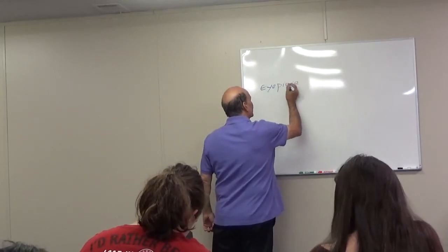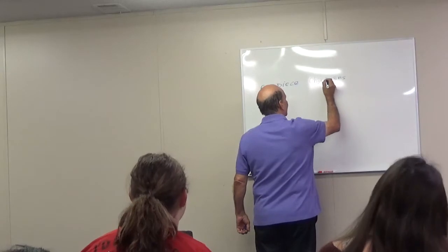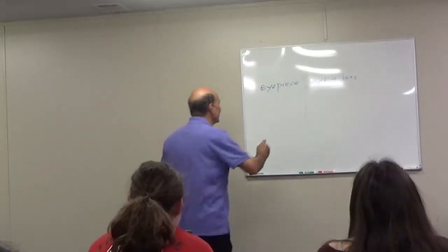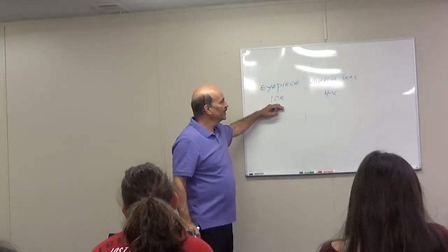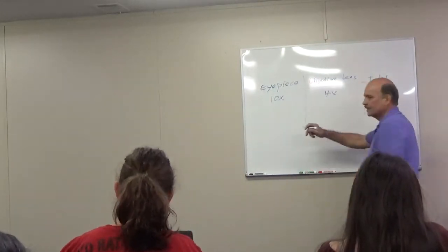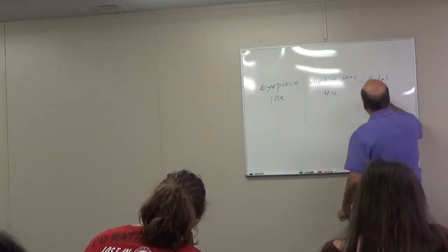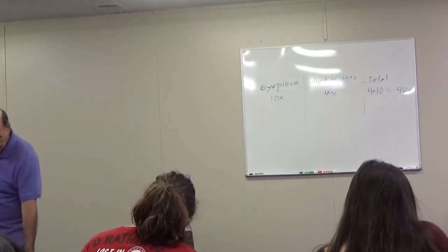Anybody tell me what do you call the lens that's closer to the object you're viewing? You mean the objective lenses? Yes. Objective lens. Now, take a look at the first one, 10 and 4. They use X after it, and that's the magnification. The eyepiece will magnify it 10 times. For the first one, the objective is 4 times. So the total magnification would be what? How do you figure that out? You multiply it. Yes. The eyepiece magnifies the image 10 times, and the objective takes that image and multiplies it 4 more times. So it's a total of 4 times 10 equals 40, and the X means power, the magnification. You should have gotten 40.